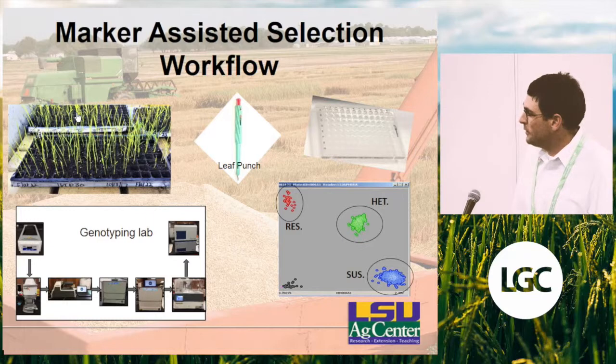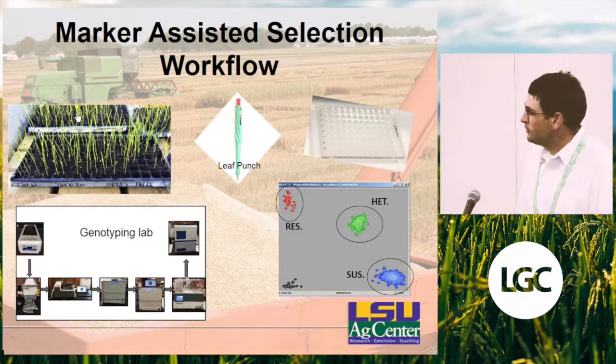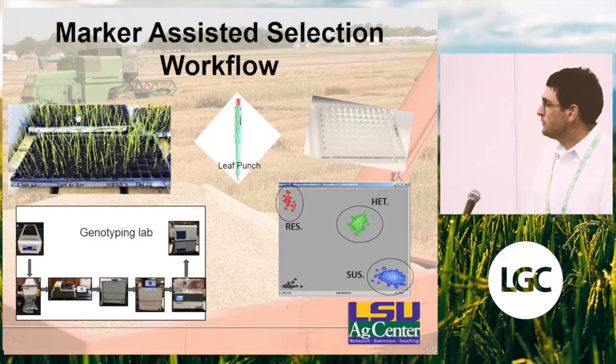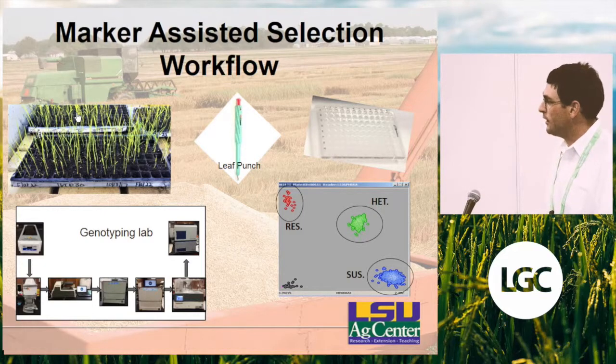And we just plant them in these little flats, and this flat has the same layout as a 96-well plate. So we don't need to worry about tagging plants or labeling plants. It's the plant's ID, it happens to be in whatever tray 30A6, and that would correspond to the DNA plate. We'll take pieces of leaf from here a week after planting. We have this little punch, and this is a kit that LGC provides, and it is very useful to get uniform sizes of tissue. And like I said, this is the biggest limitation of what we do.